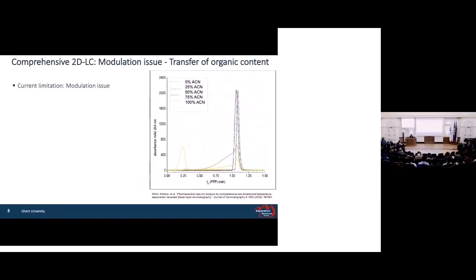What is the modulation problem? In a comprehensive system, when the sample transfers from the first dimension to the second dimension, it contains mobile phase. If this mobile phase is stronger than the mobile phase in the second dimension, it can affect the peak shape and retention time of the peak in the second dimension. This is an example of the modulation problem prepared by one of my colleagues, where RPLC was used in both dimensions — and when a high concentration of organic solvent transferred to the second dimension, the peak shape and retention time were changed. So we have to find two compatible techniques for use in comprehensive LC, and since we are going to use RPLC in the second dimension, we need one technique compatible with RPLC.